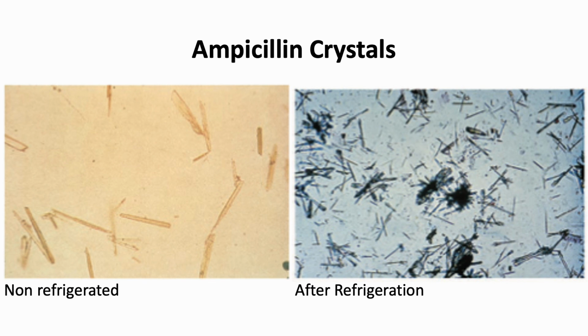Ampicillin crystals are not frequently encountered except with massive doses of penicillin compound intake without adequate hydration. They appear as colorless needles that tend to form bundles following refrigeration. Note the marked formation of the ampicillin crystals after refrigeration.